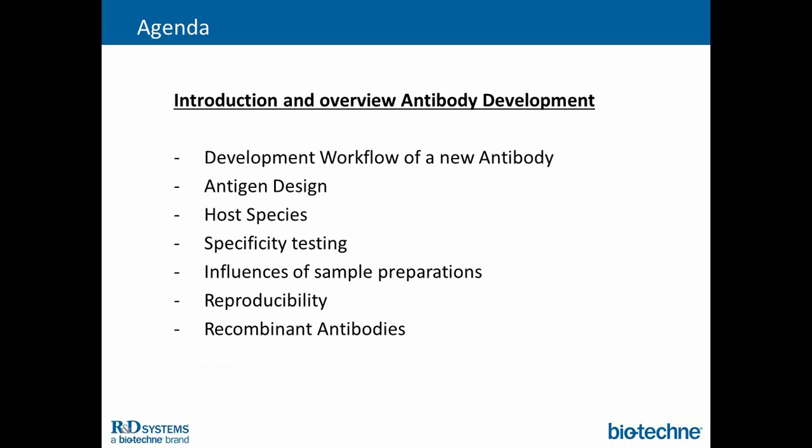So first I want to just go over the agenda real quick of today's webinar. I'm going to give you examples on how we at Bio-Techne and R&D Systems in particular are developing new antibodies. I'll give you an inside tour with specific examples on how we address some major questions that we've been raising recently, especially in regards to commercially available antibodies, that's becoming more and more important. So we're going to go over antigen design, why that plays a huge role to design the antigen right up front so you get the antibody of choice at the end with the application that you're interested in.